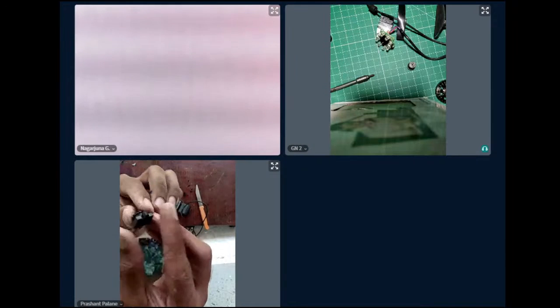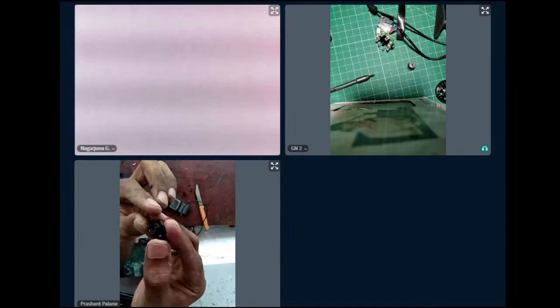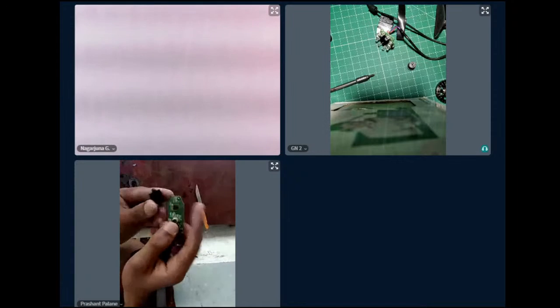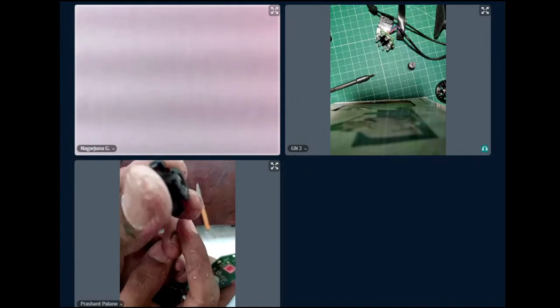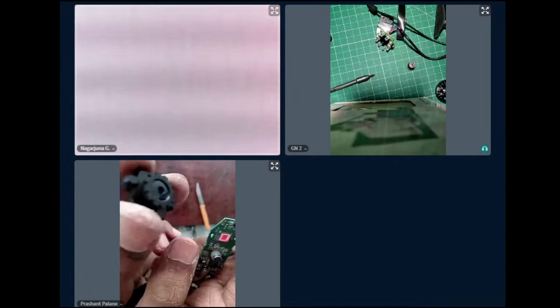And you'll have to mount it in a particular way. Particular way, मतलब वहाँ जैसा है system, you'll have to do something using two-way tape or some other material so that it stays firm उल्टा करके. But it has some curvature on that front side. So is it going to touch the CMOS? Yes. It has curvature. I see. What curvature? I'm not understanding what is that curvature. Concave. Convex. Oh, I see. Convex.